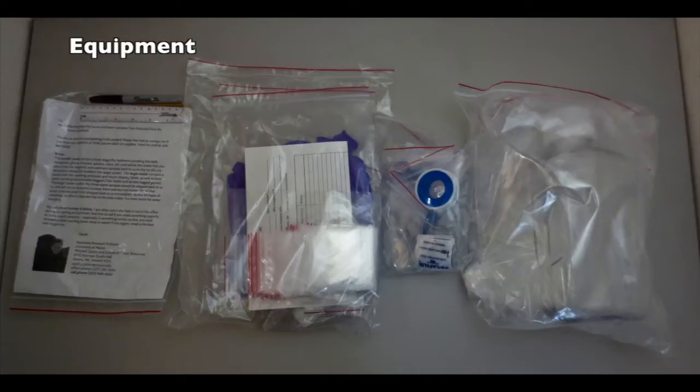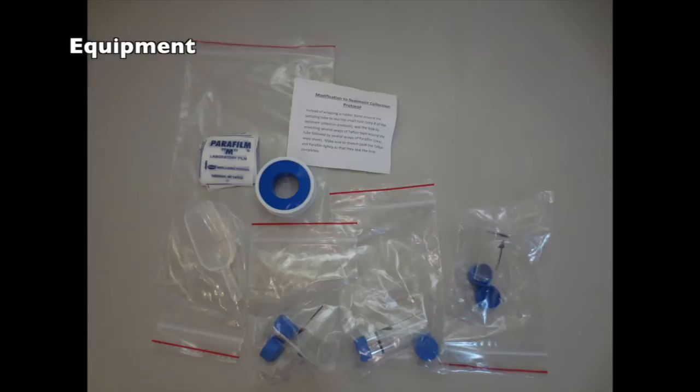When you have arranged to participate in the dragonfly project you will receive a field collection kit. Keep everything stored in a safe, clean area until you are ready to sample. For sediment sampling you will need, from the gear sent to you, three mini corer tubes pre-bagged to keep clean, with two end caps and one depth washer per tube. These will arrive with the top cap already on the mini corers.